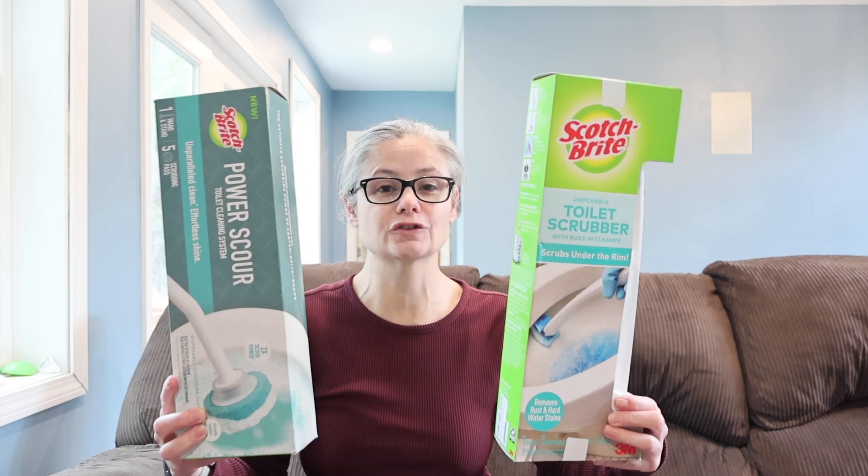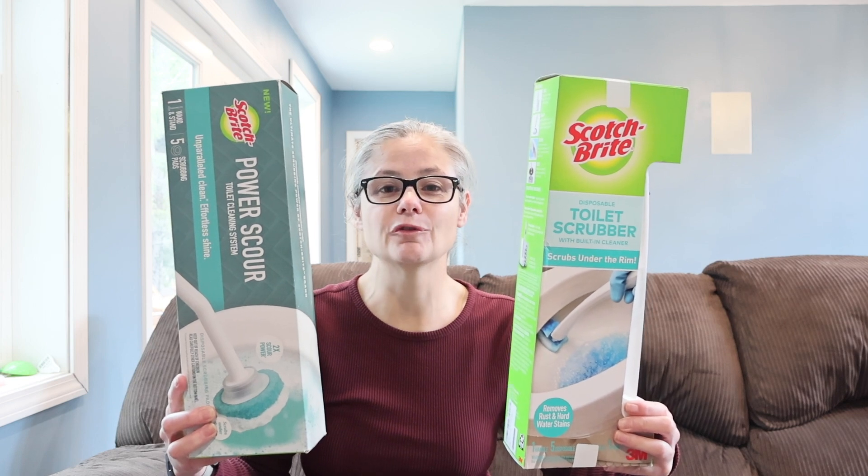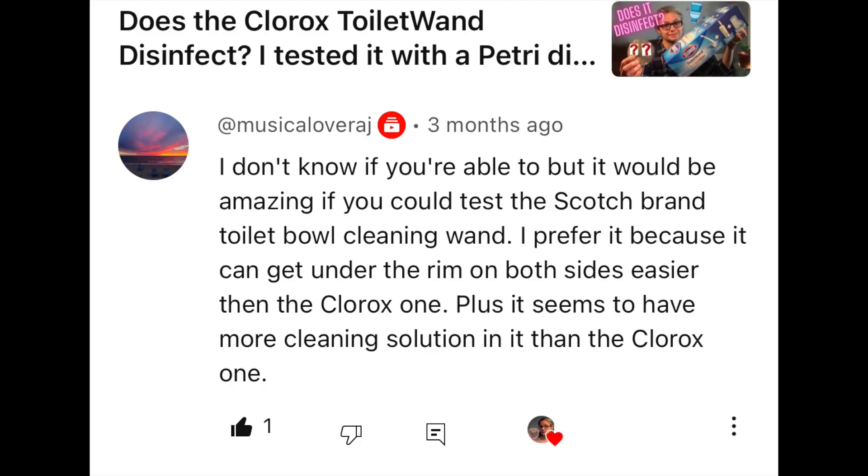Hi everybody. Today I am testing Scotch-Brite toilet scrubbers to see how well they remove bacteria from my toilet bowl. A few weeks ago, one of my viewers, Musical Lover AJ, asked me if I would be interested in testing the Scotch brand toilet bowl cleaning wand. They said it would be amazing if I could test it because they can get under the rim easier than the Clorox one and it seems to have more cleaning solution. So, Musical Lover AJ, this one is for you.